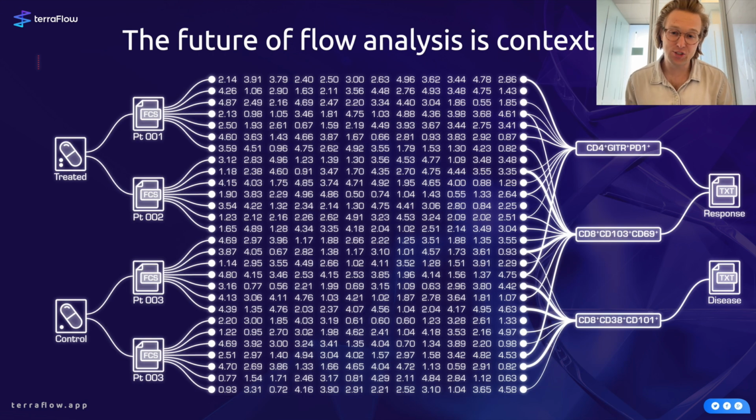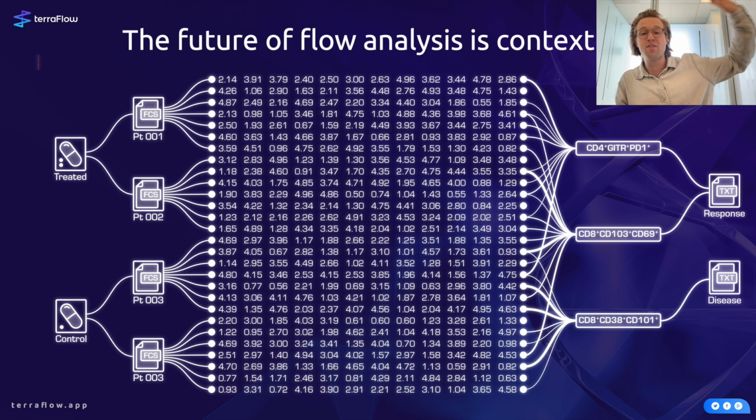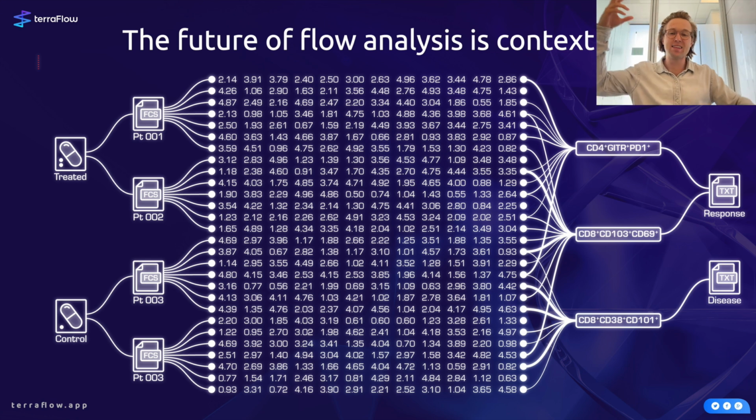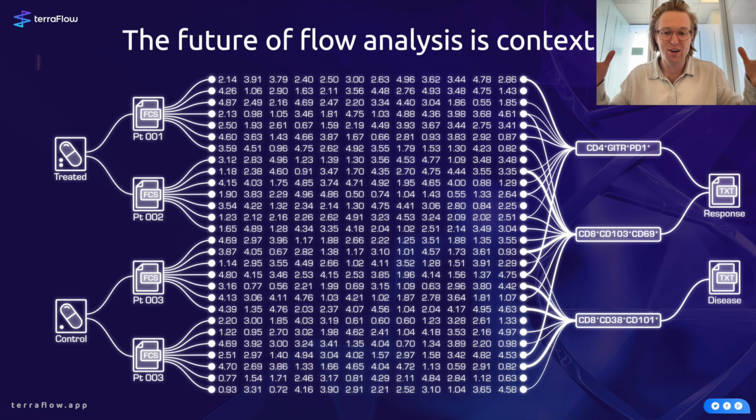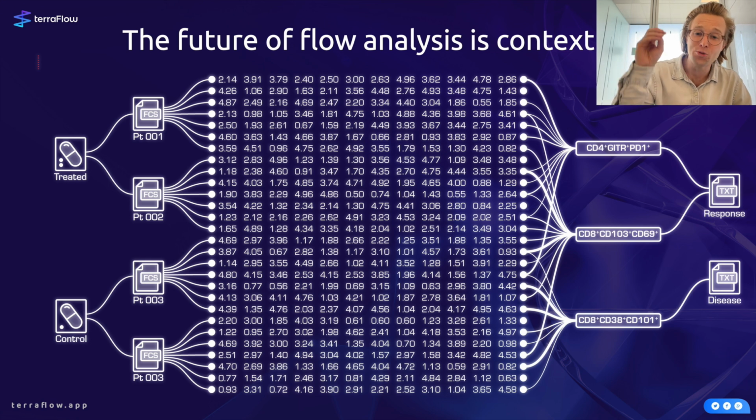I close with my vision for flow analysis as a conduit. What I mean is on the left, we have the biological material we collect from patients, which is tied to individuals with various diseases, comorbidities, and identities. And on the right, we have all published human knowledge. And the more events flow through our conduit, the more clearly these paths emerge as clear explanatory variables or as gaps for new biological discovery. The hardware is already built to support this kind of analysis, but the software needs to catch up. And the only way we do that is by incorporating real biological knowledge into the analysis itself.